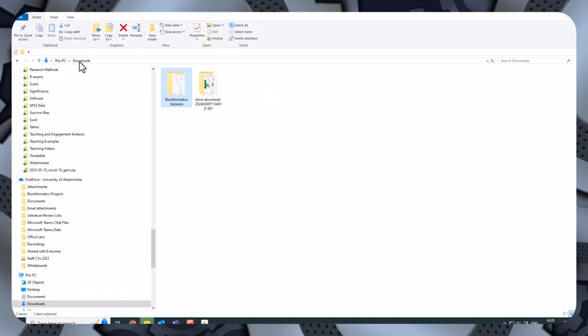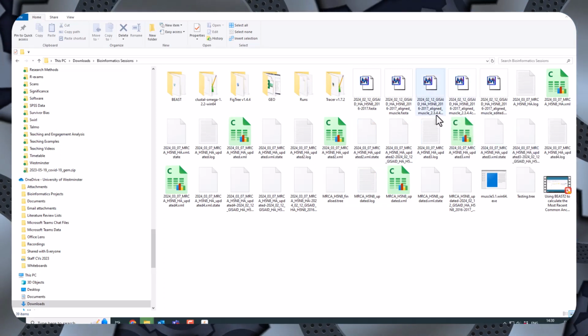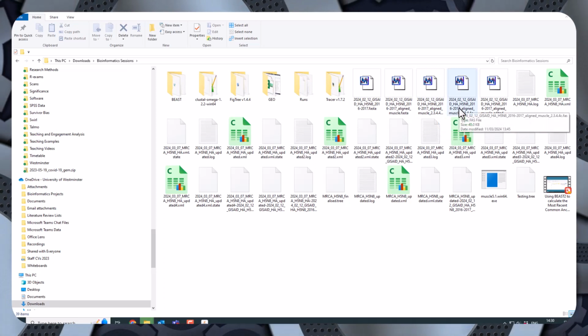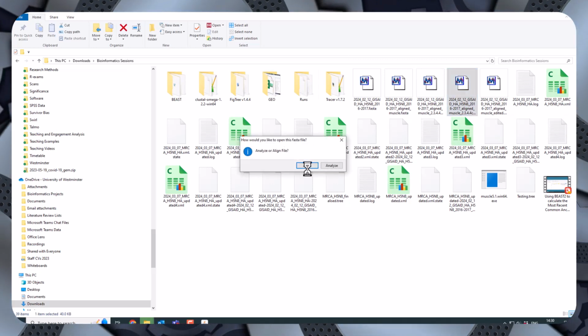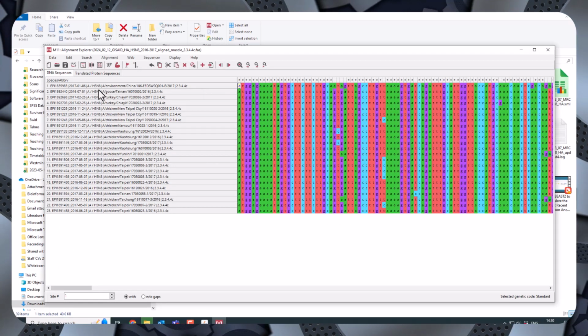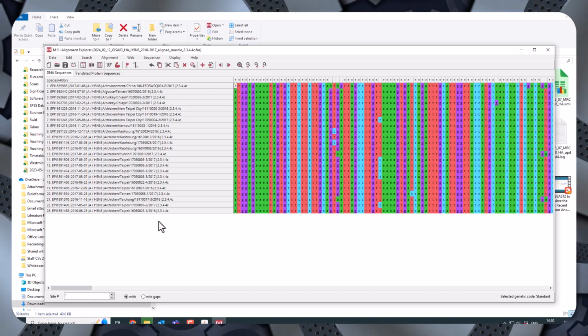So while these H5N8s were collected during the period where we had the H5N8 outbreak, I don't think they're part of that H5N8 outbreak. They're part of something else. Either that or the H5N8 was created multiple times. So this also relates to the people who are doing the relationship between H5 and preferences for different N types. Because this tells you that H5N8 was not created once, it was created at least twice and possibly more times even than that. And the other ones are all the B clade.